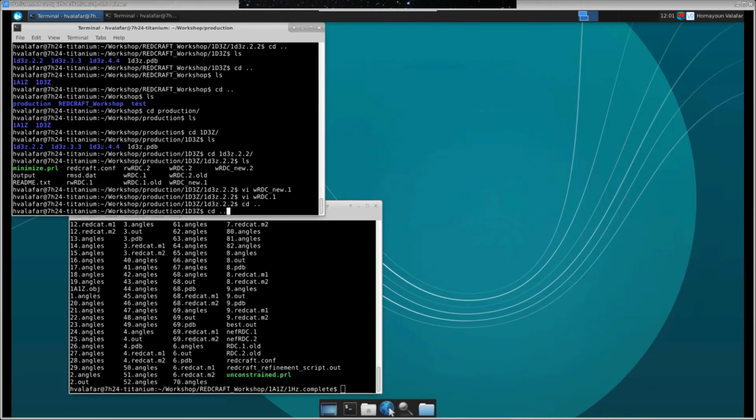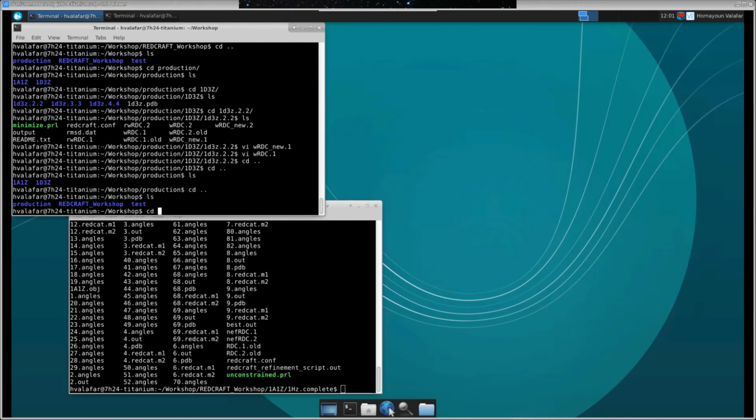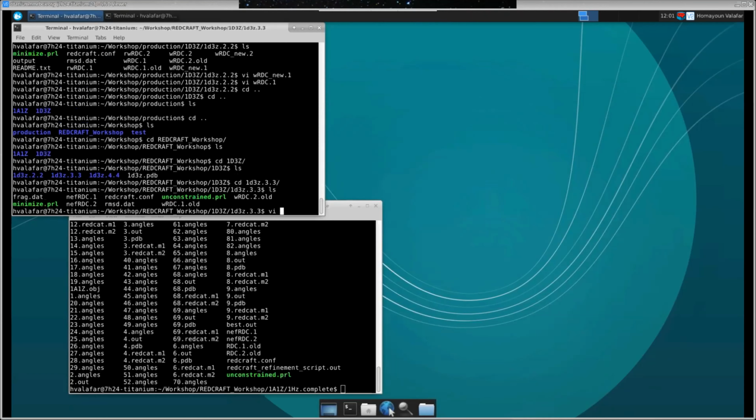But let me go back to the data that you are seeing, and let's just work with 3 sets of RDCs. Let me see what's in 3.3. Maybe I got those.